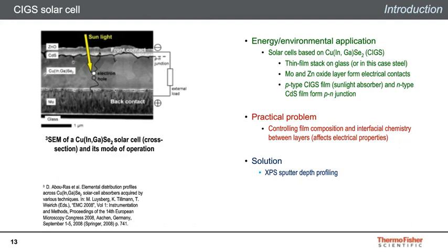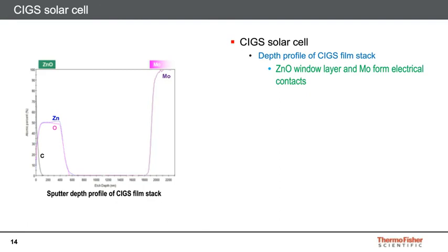A sample of a CIGS solar cell was depth profiled using a Thermo Scientific XPS tool. Argon ions were used to profile the sample. The depth scale was calibrated to a tantalum pentoxide standard. The calibration was checked using an SEM image of a cross-section of the sample. The sample was profiled using a rotating stage to get the best depth resolution through a very thick multi-layer sample. The sample rotation was performed off-axis, i.e. compucentrically, which enables several profiles to be carried out on the same sample.